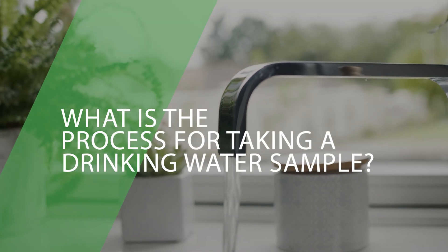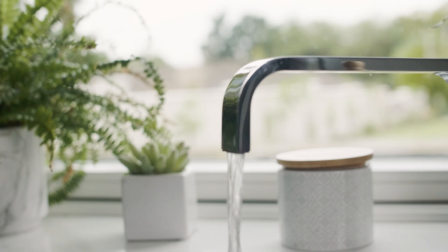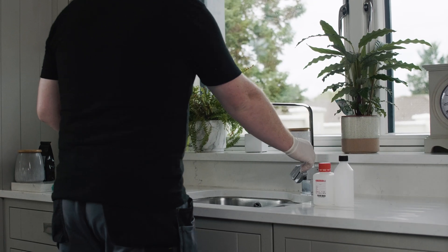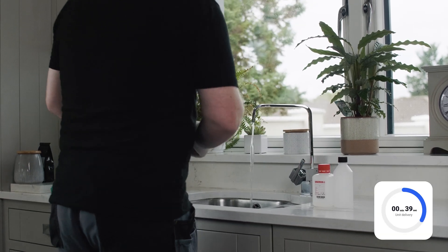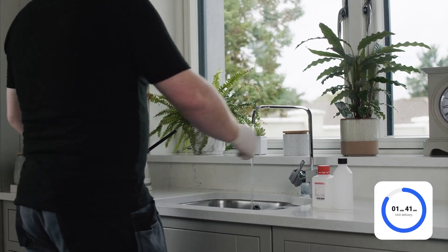What is the process for taking a drinking water sample? Step 1. Turn on the tap at an even rate for a minimum of 2 minutes to clear standing water from pipes.